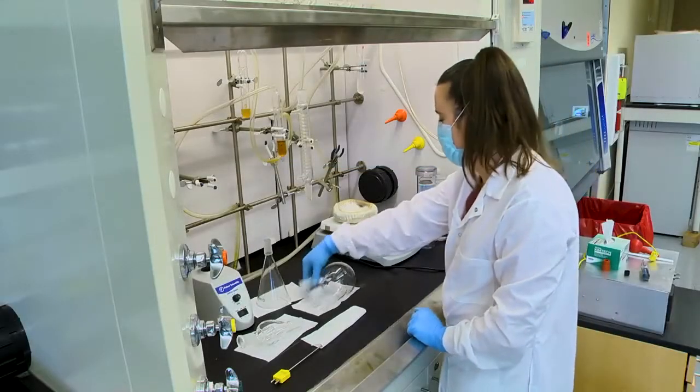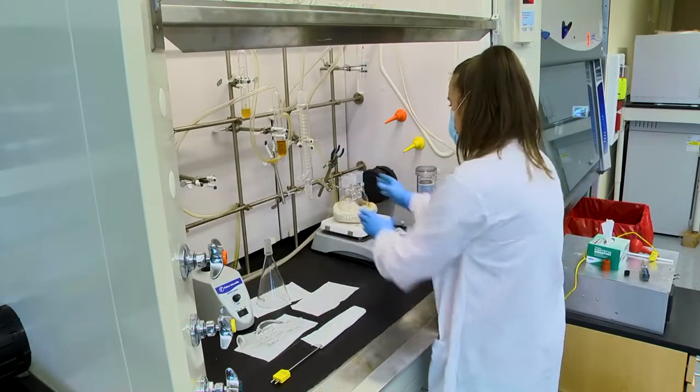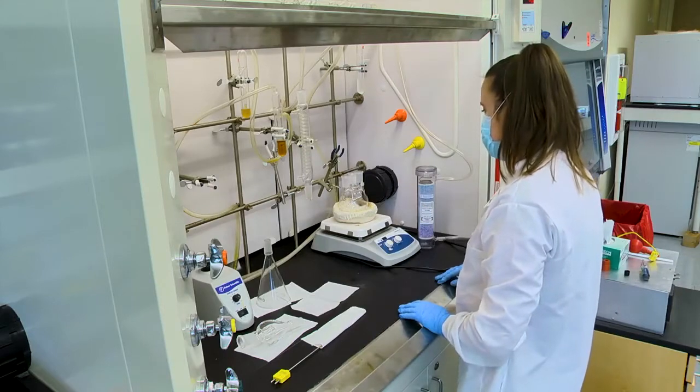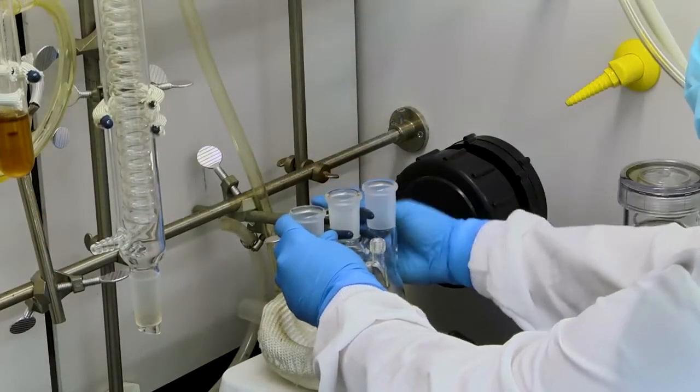Before beginning an experiment, place a four-neck, 500-milliliter round-bottom flask onto the heating mantle and secure the middle neck with a metal claw clamp.